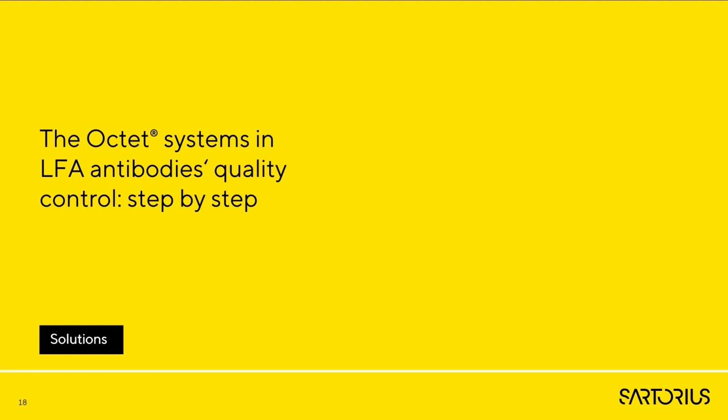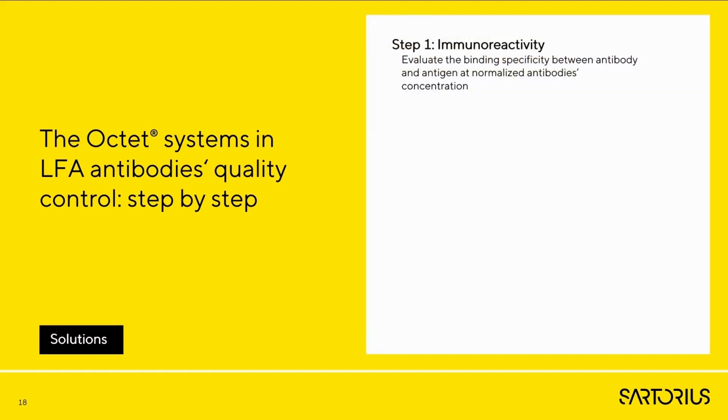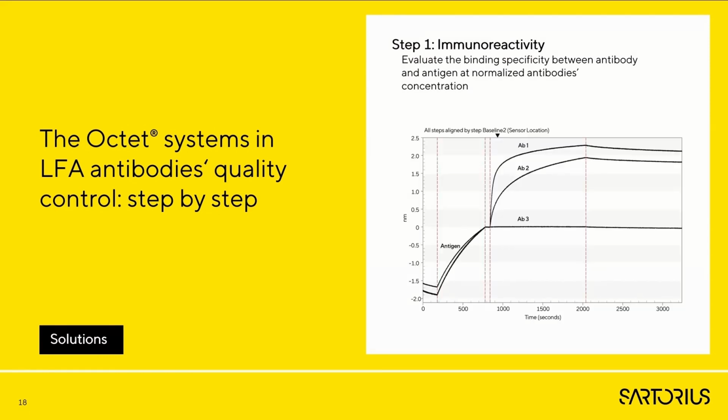Using Octet systems for performing antibody quality control involves three steps. Firstly, Octet systems allow for evaluation of binding specificity between antibody and antigen. Here you can see three antibodies at normalized concentration were tested for their immunoreactivity to a certain antigen.